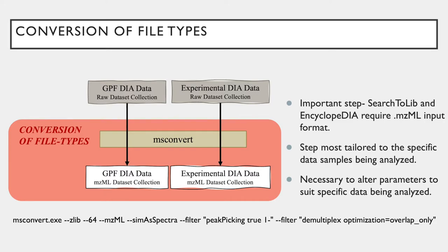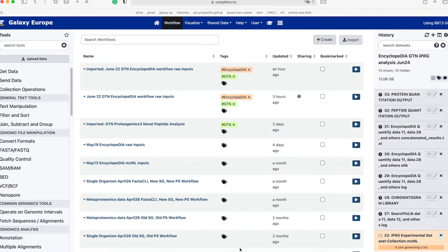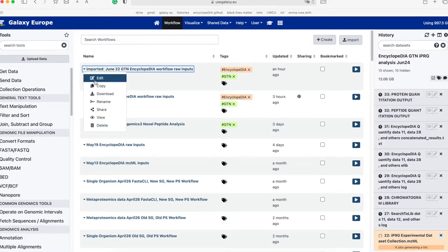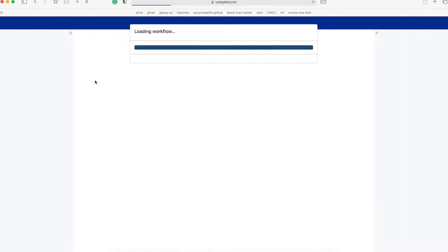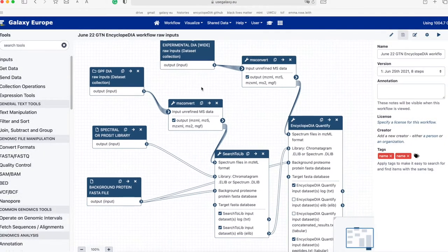In this case, the specific parameters that were changed from the default parameters are shown on the screen. I will now take you through a quick peek at the parameters on Galaxy EU. To examine the parameters of msconvert, we can go into the editing mode of the workflow. To do this, go to the drop-down menu and click Edit. Then, once it loads, go to the msconvert step. As you can see, the output type is mzml.